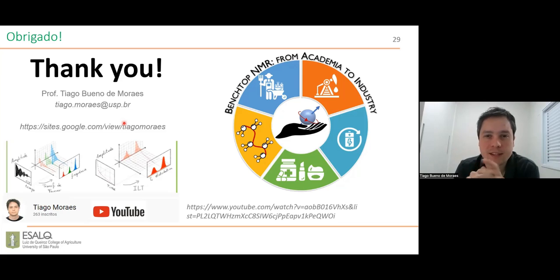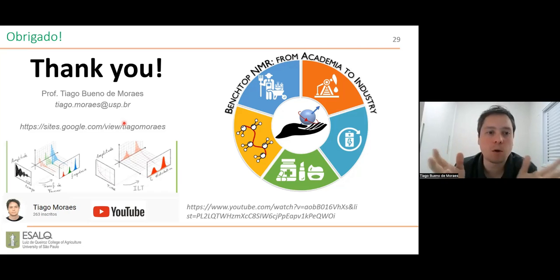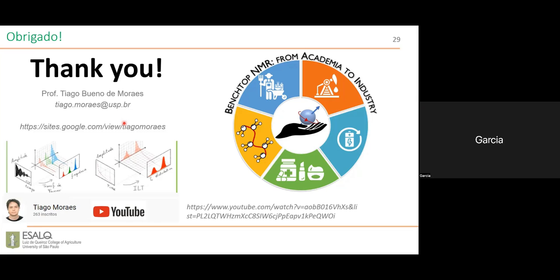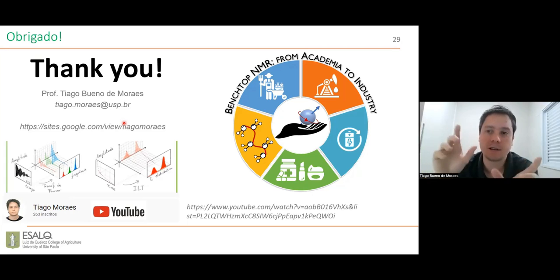This was the first question, and the second part of your question was how straightforward it is to introduce these new sequences in the commercial equipment. I think it depends on the company, and on doing some collaborations with them. I think it's easier, for example, I know that Bruker has the TopSpin software for the high-resolution NMR equipment, the high-field equipment, and it is using the same software for the benchtop equipment. So you can use the same pulse sequence and program the pulse sequence in the same language. I think this is a good idea because it's very easy to use both.